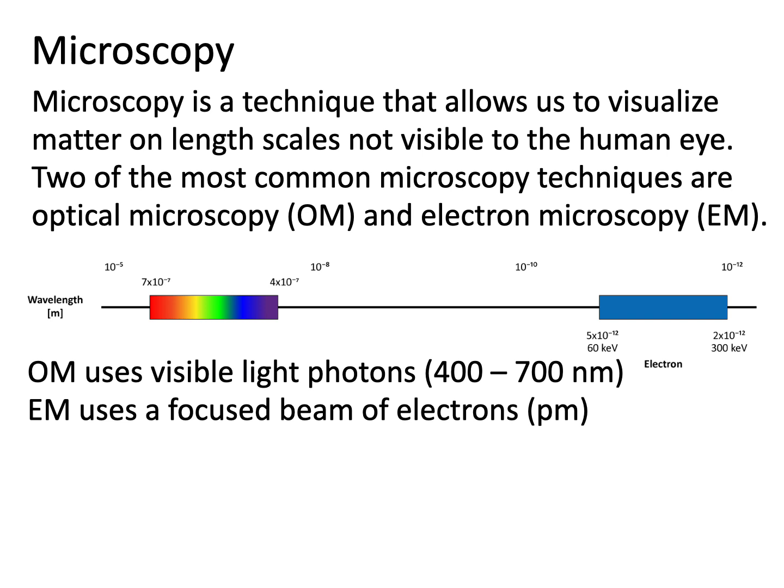unaided eye. Two of the most common forms of microscopy that are used are light microscopy or optical microscopy and electron microscopy. So it's kind of using electromagnetic waves or properties within the visual light spectrum, but then also those exhibited by electrons, depending on the type of microscopy being employed.